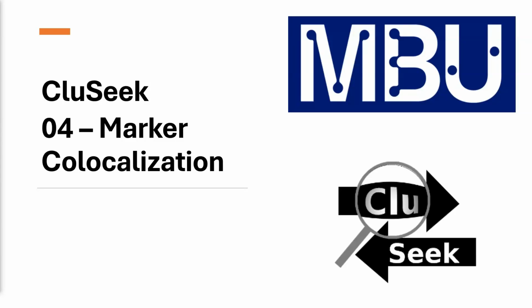Welcome to Cluseek tutorial number 4, Marker Colocalization.